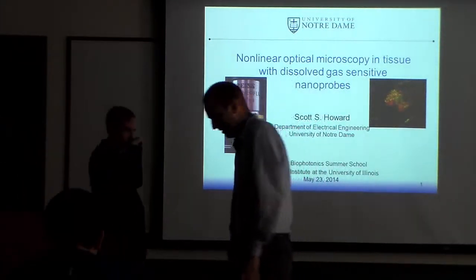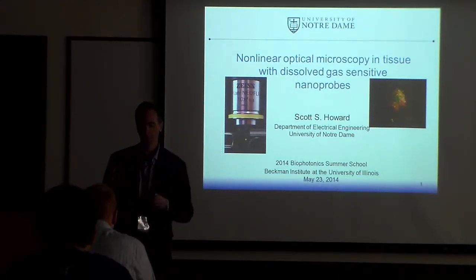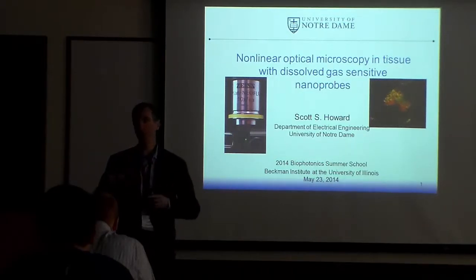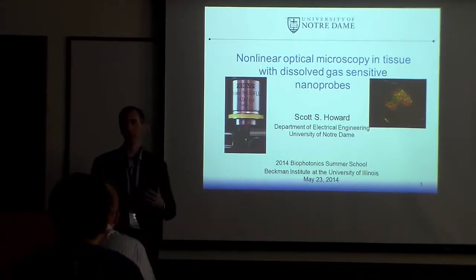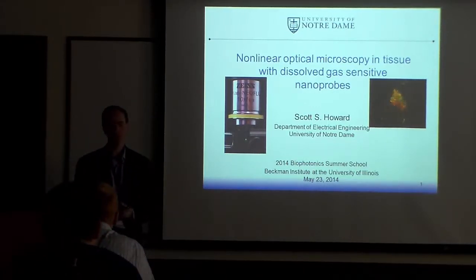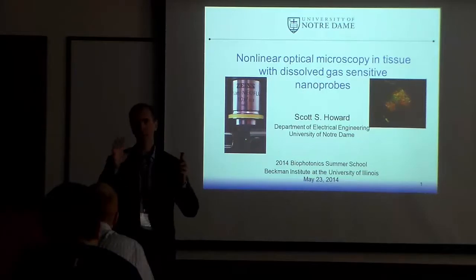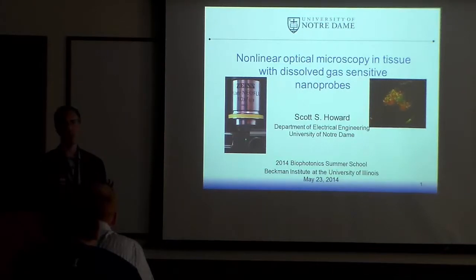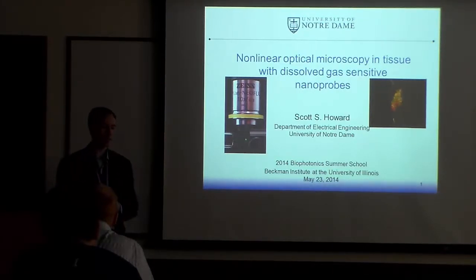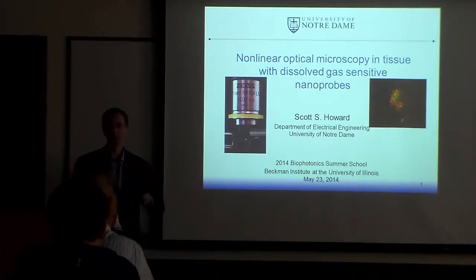Great, sure. Like Dan was saying, my main work is in two different sides. I do mid-infrared, some biosensing, some chip and laser work, and then on the near-infrared we use nonlinear optical microscopy. Next week you have my postdoc advisor here, who'll be talking about some advanced topics of that. In the mid-infrared, you get all these vibrational signatures and very good quantitative measurements. And in the near-infrared, with nonlinear microscopy, you can get very nice high-resolution, three-dimensional images of tissue.